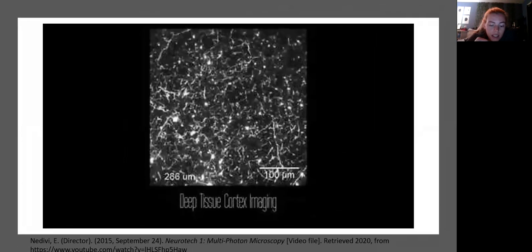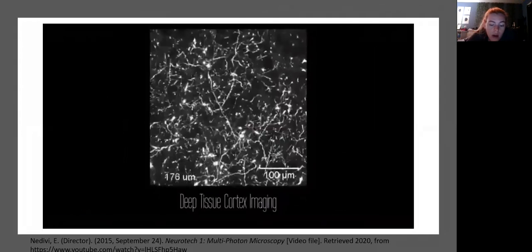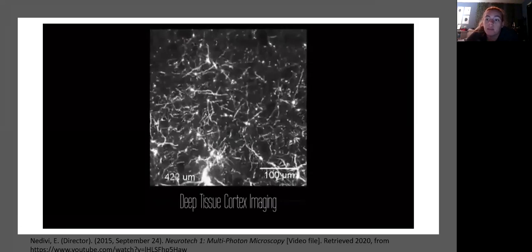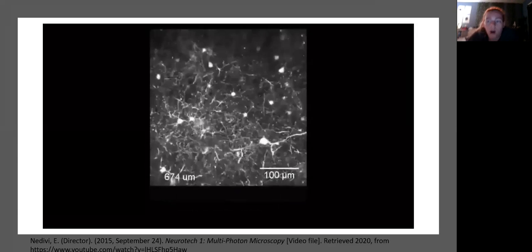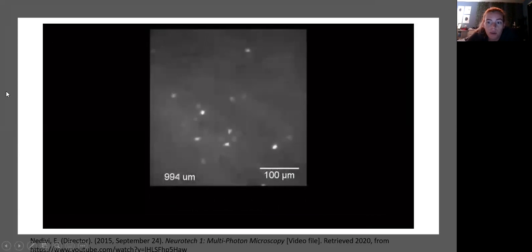The ability to then pinpoint and reject the outer spaces moved them on to fluoroimaging, where they were able to add in the real-time spectrum, where they could pinpoint proteins and give them a certain dye and color, and then be able to watch these reactions, such as this one happening in a cerebral cortex.